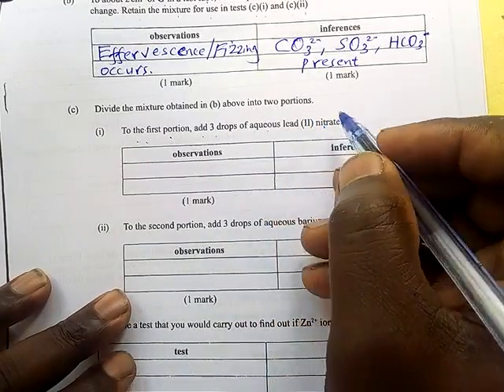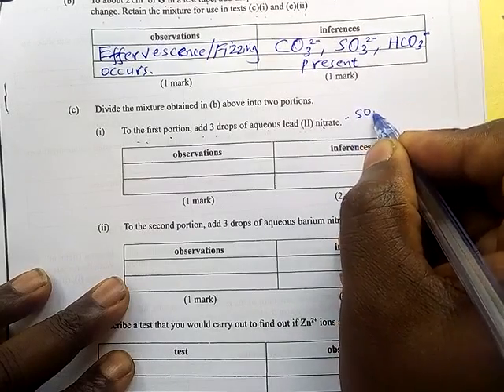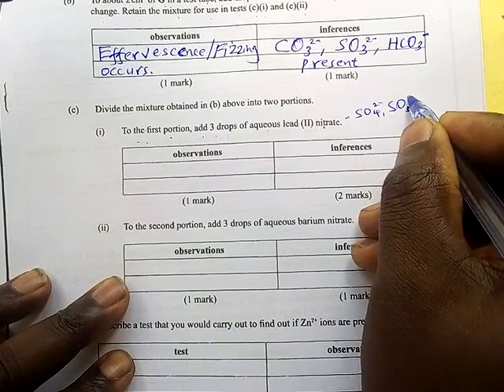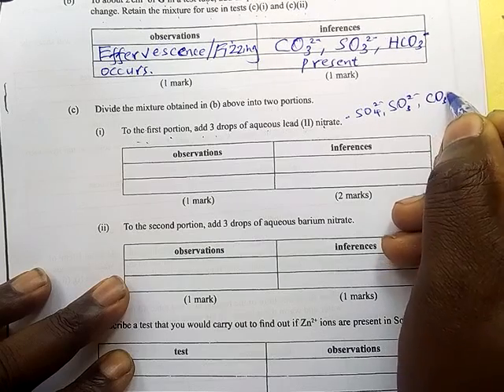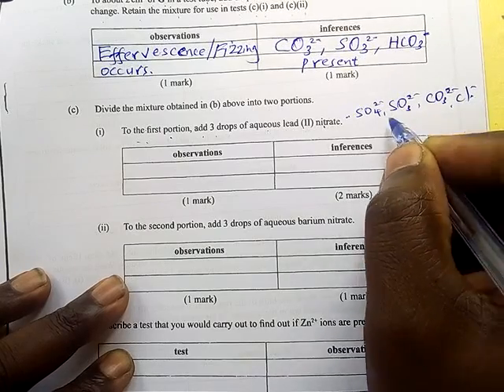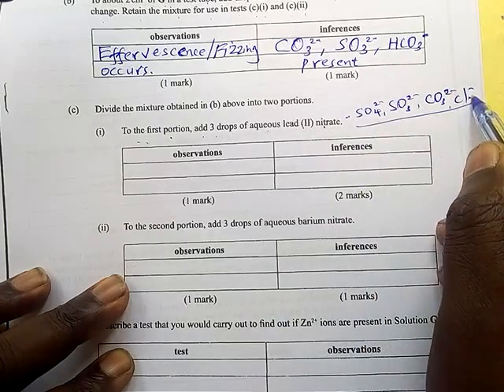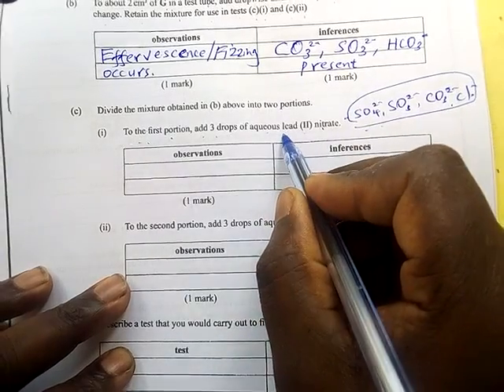We know very well that lead nitrate is used to test for the sulfate, the sulfite, the carbonate, and the chloride, because all of these will form a white precipitate with it.